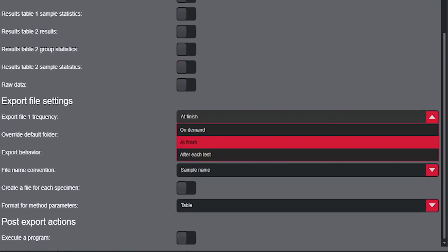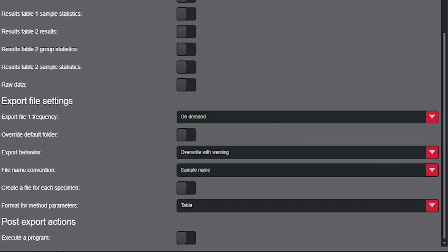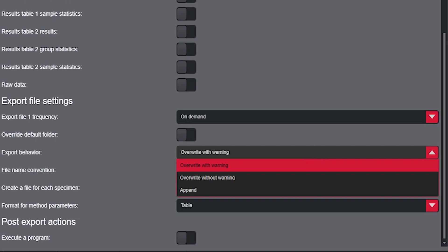Also, within the Setup tab, users determine when the export should occur, such as at finish, on demand, or after each test.